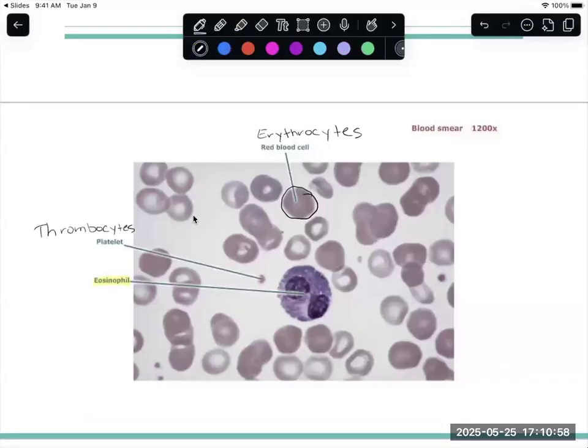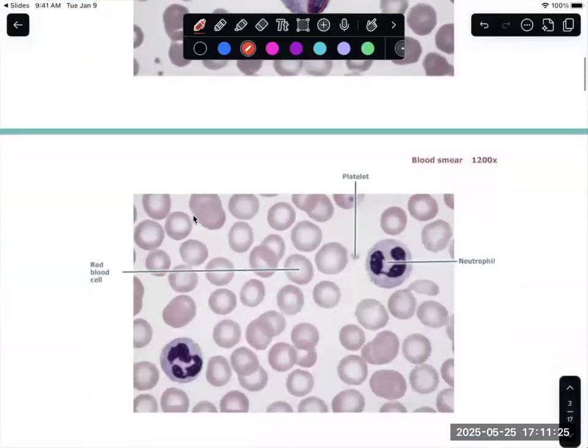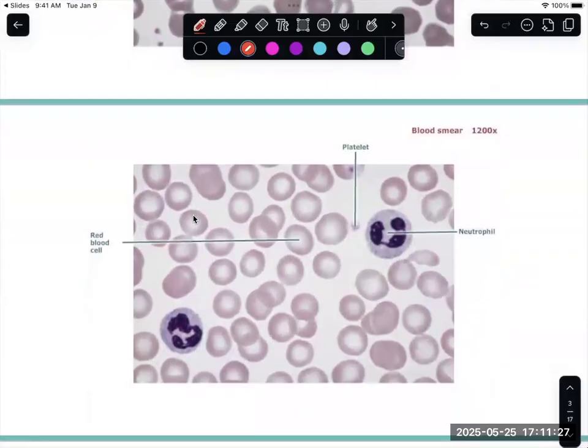What distinguishes an eosinophil from other types of white blood cells is what is known as a bilobed nucleus. So this nucleus here, there's one here, there's a little connecting point before we get this second lobe. So it's just one way to decipher one of these cells from the next. Here, those red blood cells, again, are those erythrocytes. Those platelets are those thrombocytes.